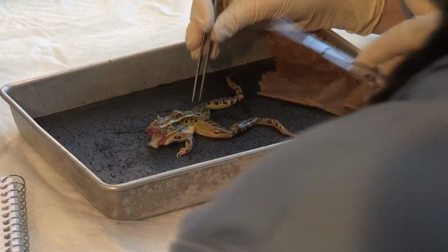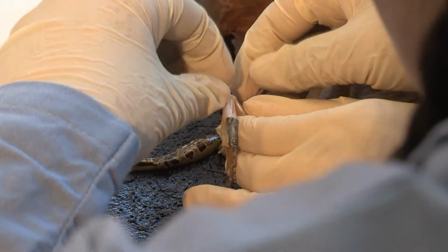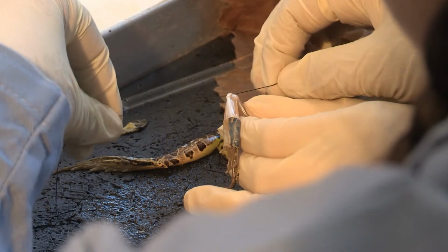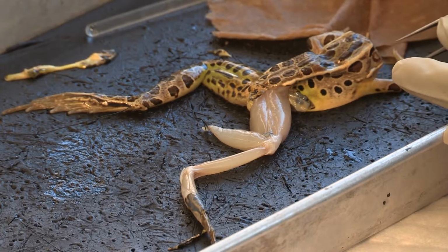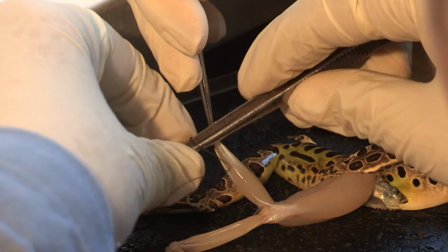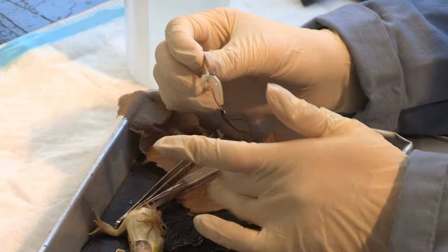response to electrical stimulation. First, the skin is removed to expose the underlying muscles. The sciatic nerve, which innervates the muscle of the hind legs, will be tied off and isolated. The gastrocnemius muscle, scientists sometimes refer to this as the gastroc, will be tied off and isolated. Once the other tissues have been sufficiently removed, we will cut the femur and the tibiofibula to dissociate the muscle from the hind leg entirely.